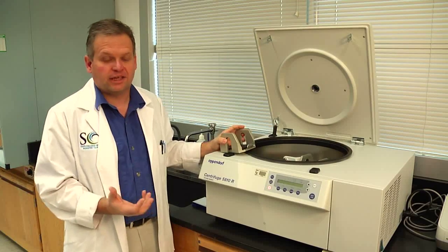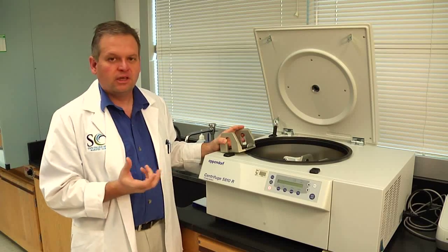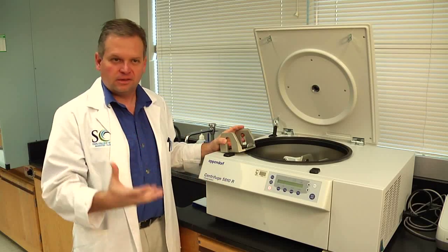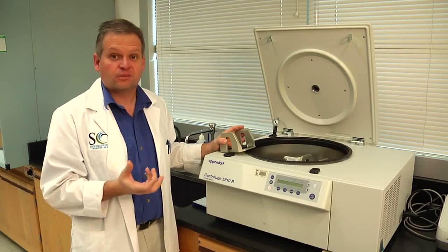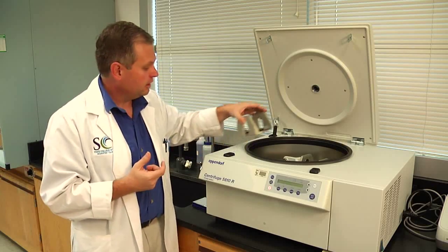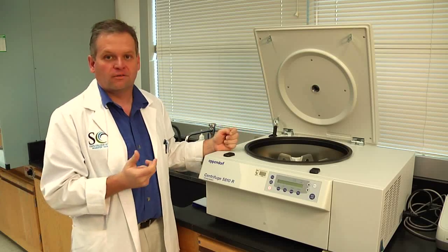This is a specialized centrifuge that basically spins things. The idea is this is going to open up avenues for our students that we wouldn't normally be able to, giving them another set of skills that are going to put them that much further ahead for the burgeoning cluster of small biotech companies in the area. You're going to use this to prepare samples, and that is a big biotech skill — preparing samples for sale or for other testing.